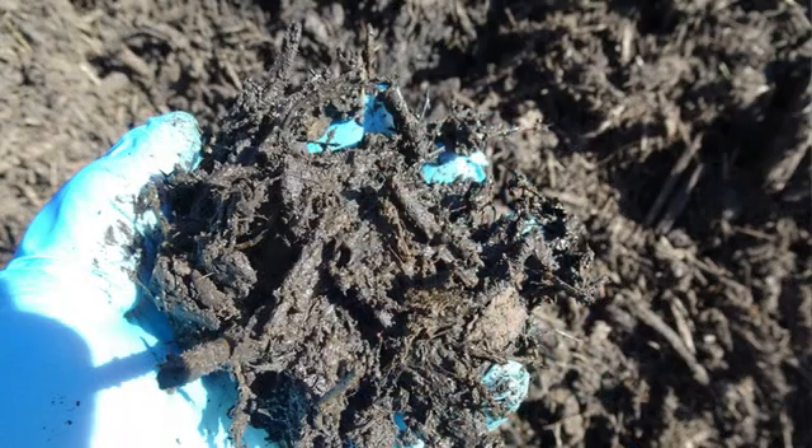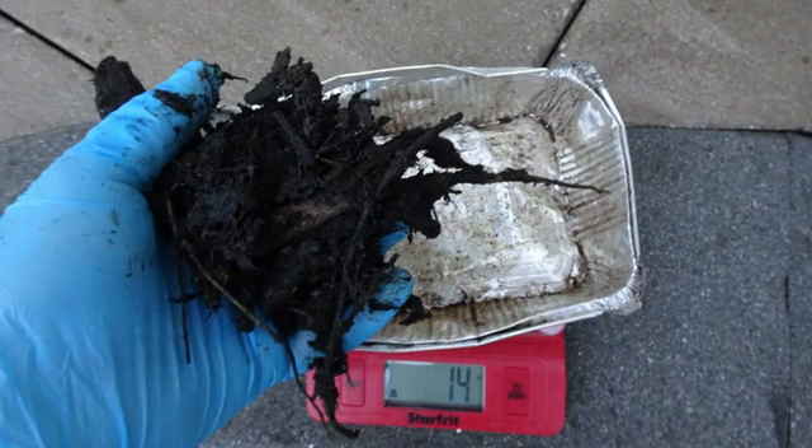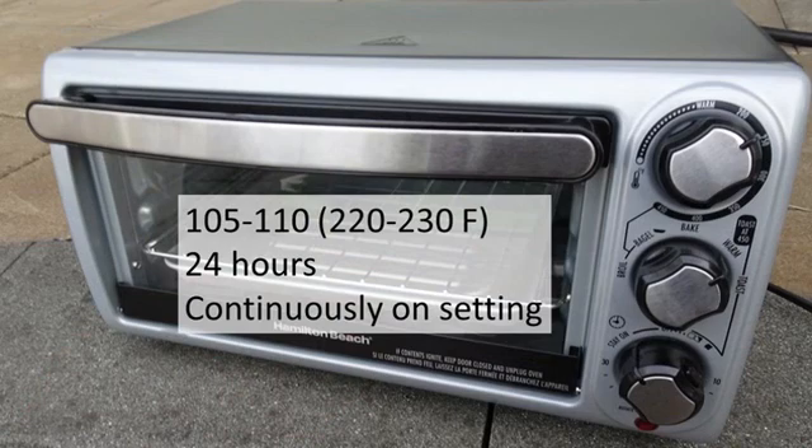Measuring moisture content accurately involves taking a representative sample of the composting material and placing it in an aluminum tray. The tray with compost is then weighed on a postal scale and placed in the toaster oven. The oven needs to be on continuous heating — we suggest 24 hours of drying at approximately 105 degrees Celsius or 220 to 230 degrees Fahrenheit.